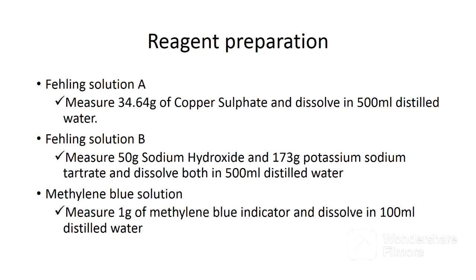The next reagent to prepare is methylene blue solution. To prepare this, measure 1 gram of methylene blue indicator powder and dissolve it in 100 ml of distilled water.